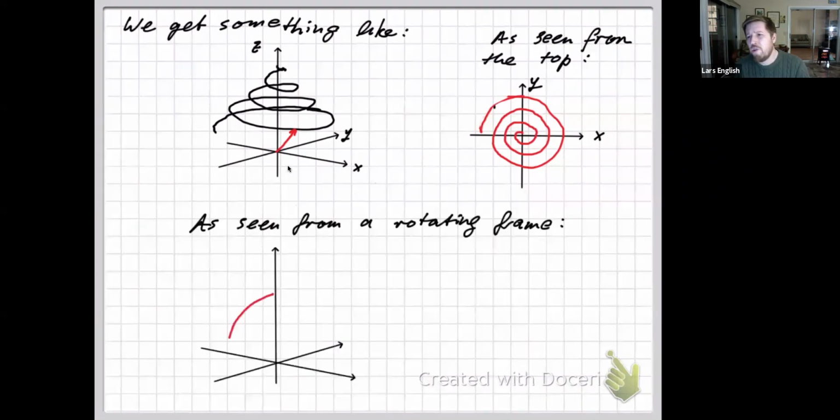Now, another way to visualize this is by boosting into a rotating frame. So instead of your laboratory coordinates x and y, we're now looking at it from a frame that rotates with the spin. Here I'm labeling these axes x prime and y prime. These are axes that rotate with the precessional motion of the spin along the z-axis. If you eliminate this quick motion about the z-axis, all you're left with is this tilting down into the xy plane. Does that make sense so far?